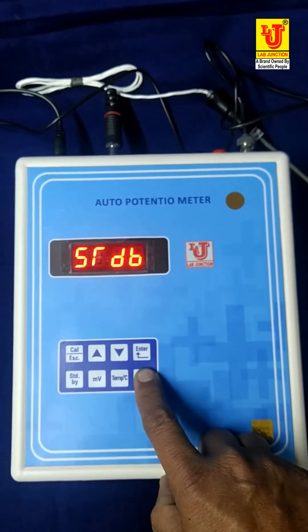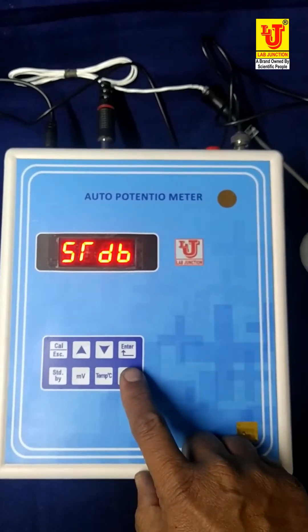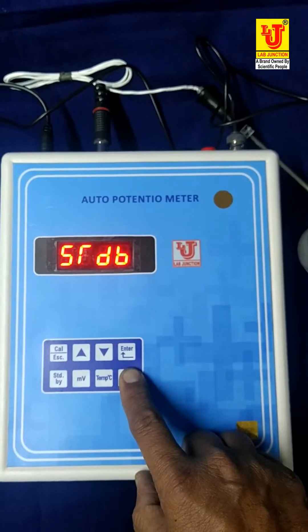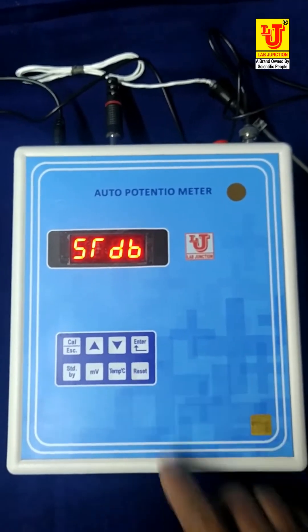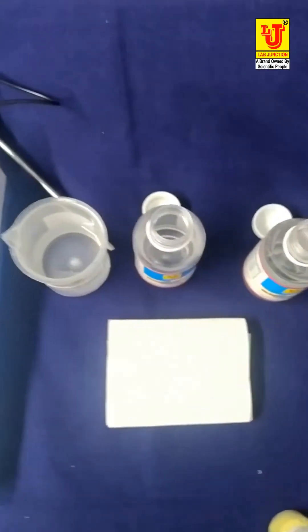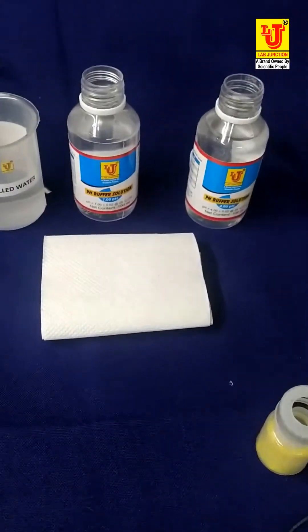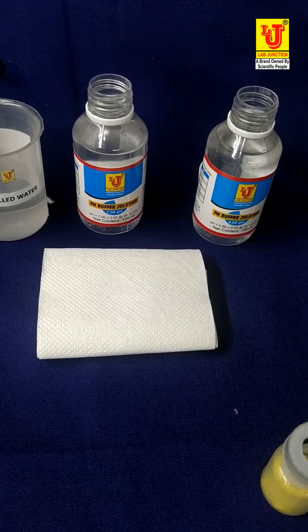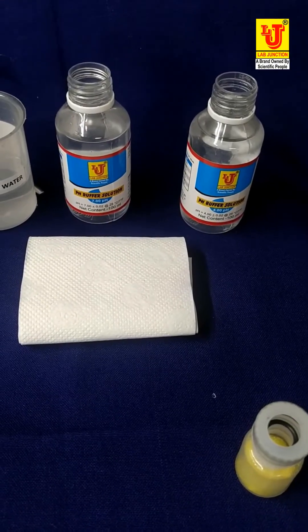Now the instrument restarts. You have to first reset it — press and long press. These are the standard solutions. The first bottle is pH buffer solution 7, and the second bottle is pH buffer solution 4. Now take your ORP electrode and dip it in the pH 7 buffer.